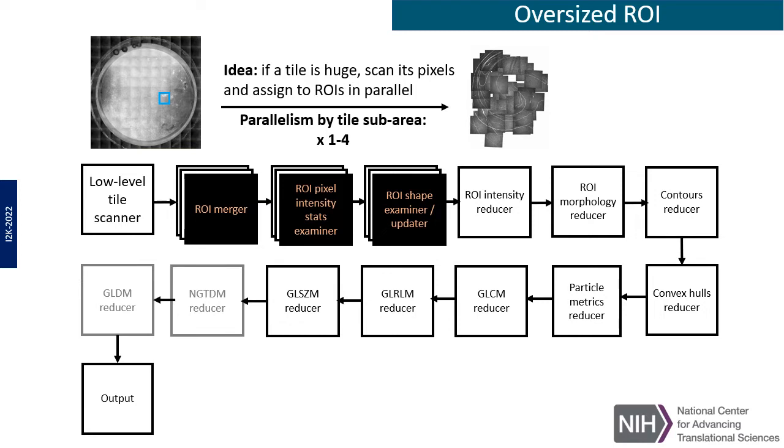The middle zone operates in a sequential mode when a region of interest is so massive that its pixel cloud and temporary structures exceed the amount of computer RAM. An example is a large region of interest of a neuron cell on the middle top image. Another important case is whole slide image feature extraction.